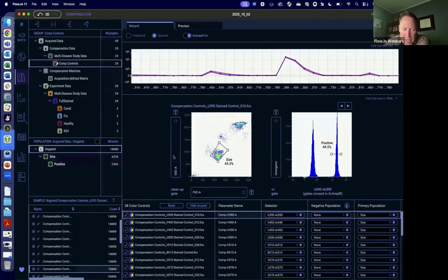Okay, there's that. Uncheck a box if you don't want to use a control to make a parameter. So this would still be available to use as the universal negative or something like that. And if you turn off the color, you see it goes gray, or in this case, a pale blue since it's Veronica mode, and it will appear in the drop-down as a potential representative negative population for many samples. So I'm going to use it here for now, as we actually could use it. But that is the gist of the controls while setting this up.